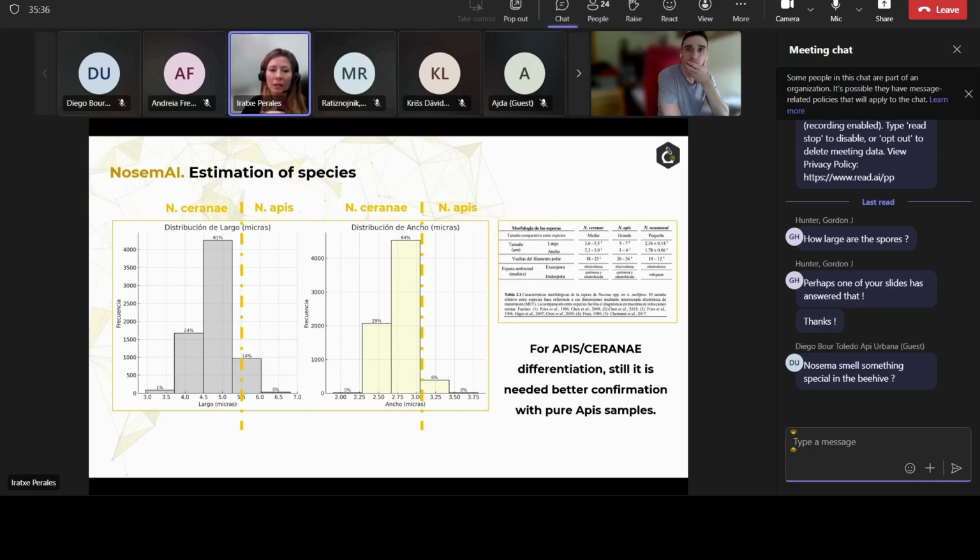And then when we created the models, we had to iterate a lot of times. We also had to create a specific segmentation model to identify very accurately the dimensions of the sample, and then to measure. So to launch the training was 1 week, but then to iterate and implement better models, maybe 3 or 4 months more. Nice. Thanks.